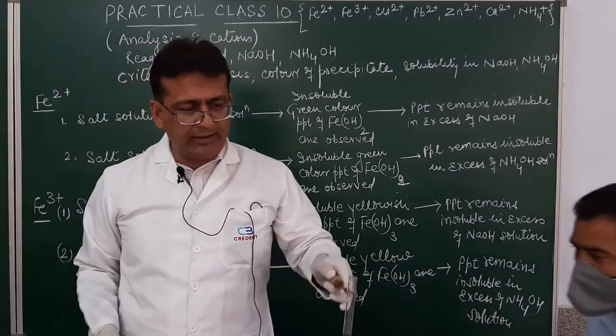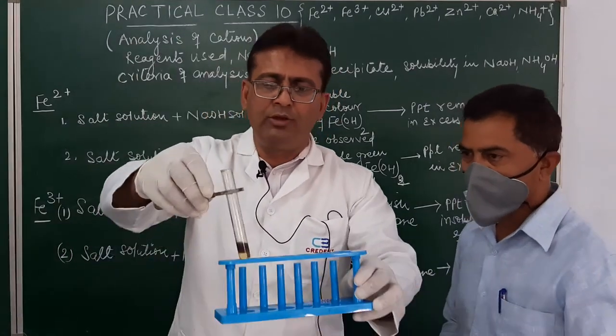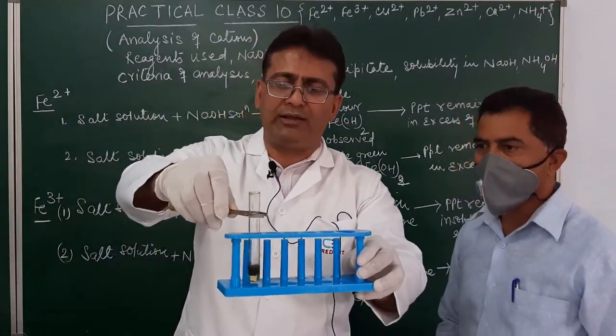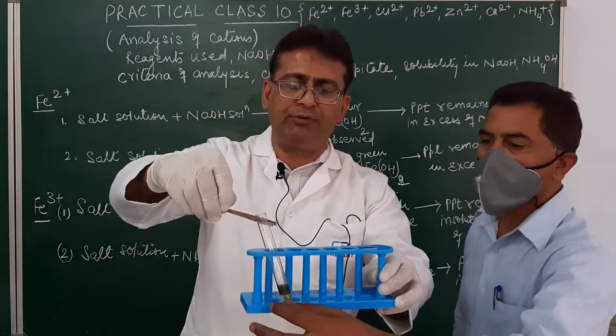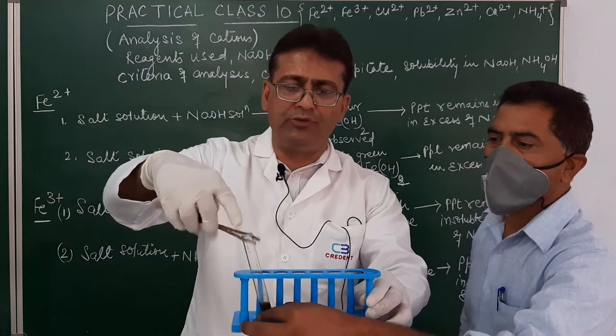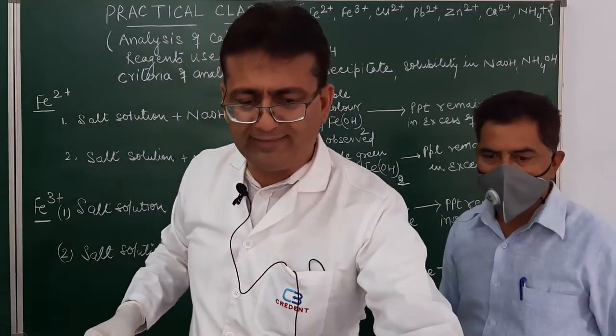Now, in the exam, you have to put the test tube in the test tube stand like this and keep it in a demonstrative manner. So, this over here will be kept in this manner. So, this is the first test for ferrous ion.